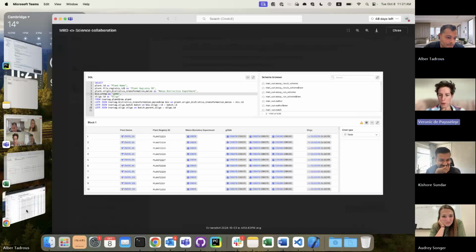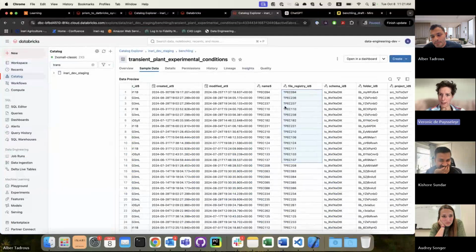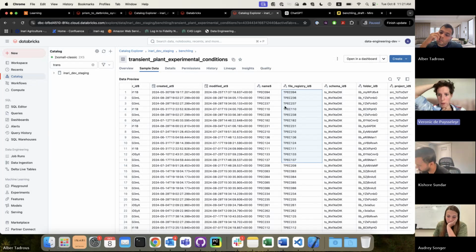So looking back, we should have constructed also the Benchling schema. We should have added it to the agrobacterium transformation soy and maize, and then have a metadata field for early sampling or so. We should have done that. But the reason why we have it in separate schemas is because in science, those are completely separate teams.